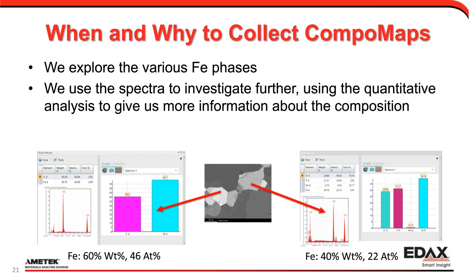And I really love this display because, as you know, a spectrum peak height is not necessarily indicative of the concentration. Sometimes you might have a spectrum peak that's more intense than another, but the concentration might actually be lower than another.